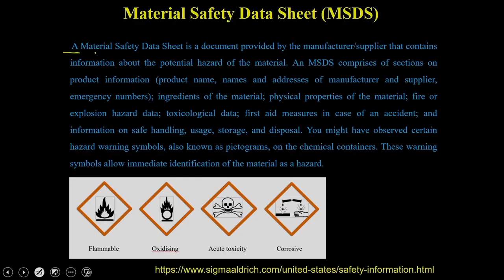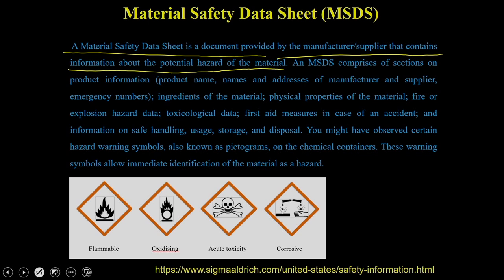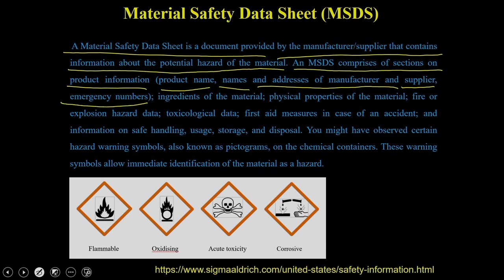A material safety data sheet is a document provided by the manufacturer or supplier that contains information about the potential hazards of that material. The MSDS is comprised of sections on product information: the product name, names and addresses of manufacturers and suppliers, and emergency numbers. In case of spillage or exposure to a particular person, it will tell you the emergency number so you can call and get solutions on how to handle the situation.